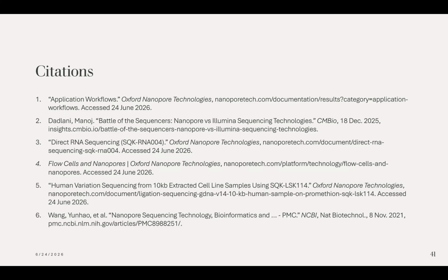Yeah, so again, I haven't personally done that just because I've been more interested in the whole genome sequencing. But we have looked into that. The only thing is I can usually get a really high, like a 30x coverage output within a 2 or 3 day sequencing run without using adaptive sampling. Of course, the coverage is going to vary across the genome. But generally speaking, I haven't really had the need for it.